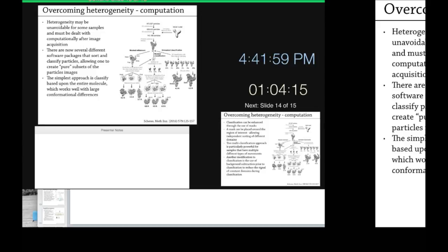The other thing is, I don't know how many of you have used various auto-picking programs. In some, when they do it, it's just a blob. Relion, I think, now has a blob search as well, where anything that is black, so anything that looks like a particle, should get picked, and everything that's not isn't. The problem is that means you're also going to pick any ice contamination, and so sometimes it can be helpful to go back and manually clean it, but then, as you said, you're introducing bias by manually cleaning it.